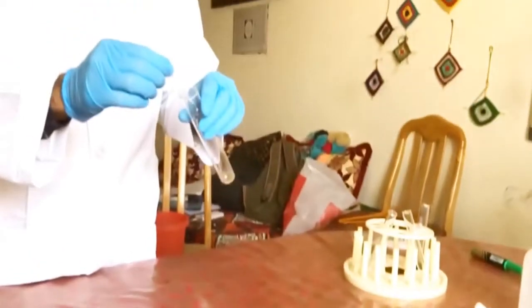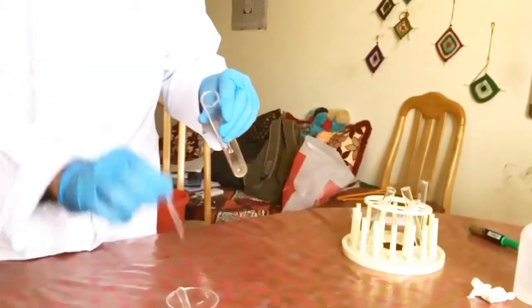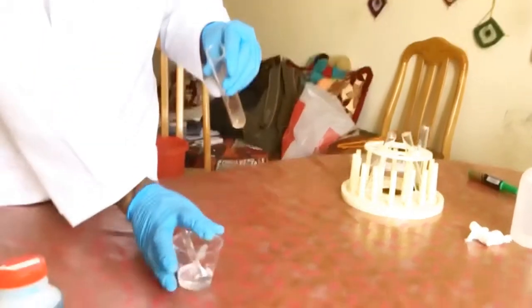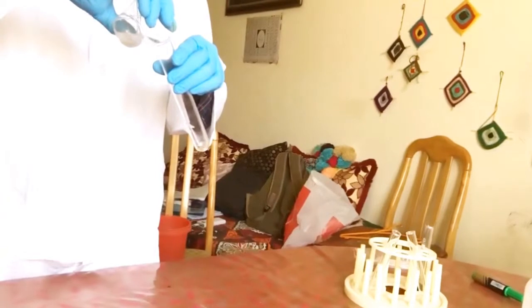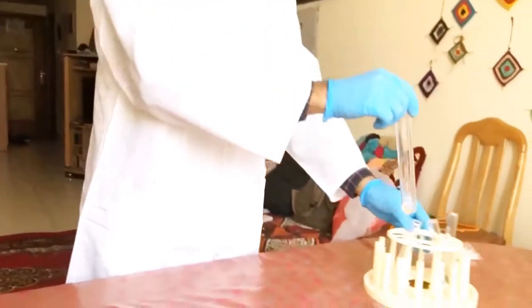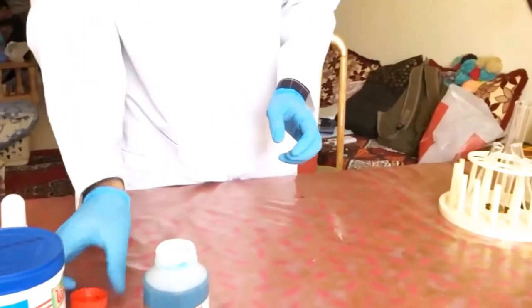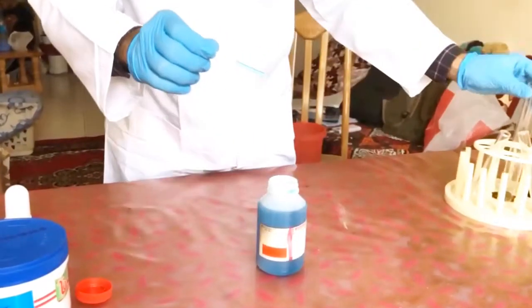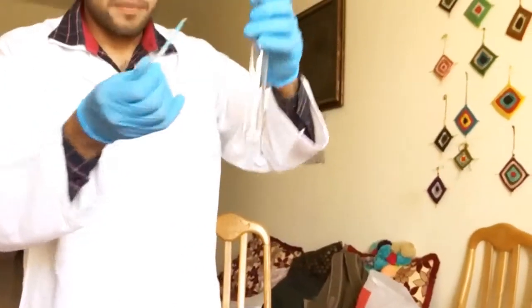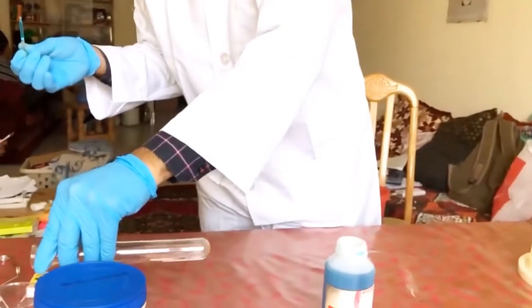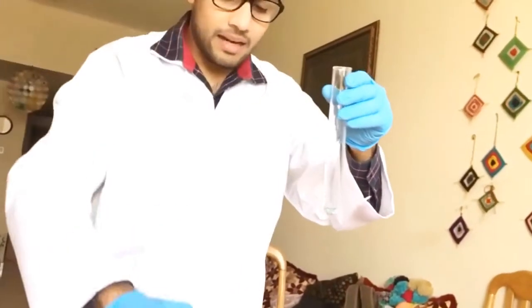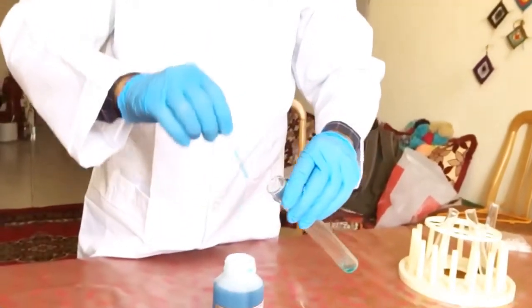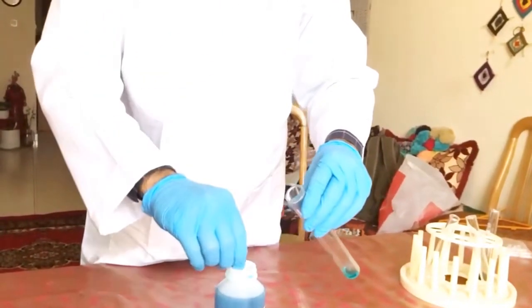Next is to keep this aside and take our benedict solution. Again we'll be measuring the same equal quantity amount. We want double the amount of the sugar solution, so I will keep adding till I find that the quantity is double of my sugar solution.